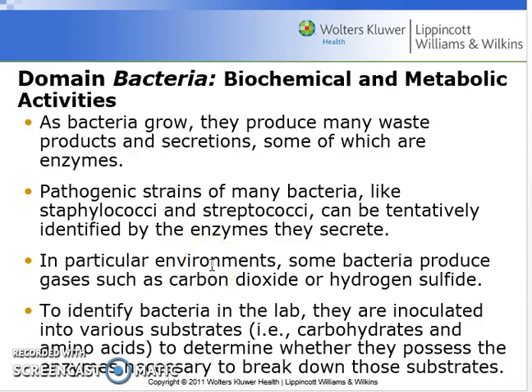So to identify bacteria in the lab, we can use differential media that contain different substrates and enzymes to determine how the bacteria react in that particular environment. How they react will give us a color change, and from that color change we're able to interpret different biochemical and metabolic activities that take place within the bacteria.